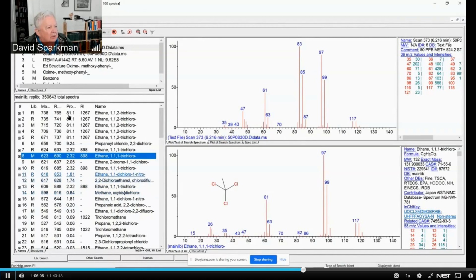And the probability of having matched the sample spectrum against the library spectrum was 81%. Therefore, he picked up the telephone and called the boss and said, "Boss, this result is 1,1,2 trichloroethane." Okay? And slammed down the phone, ran out, and went on vacation.